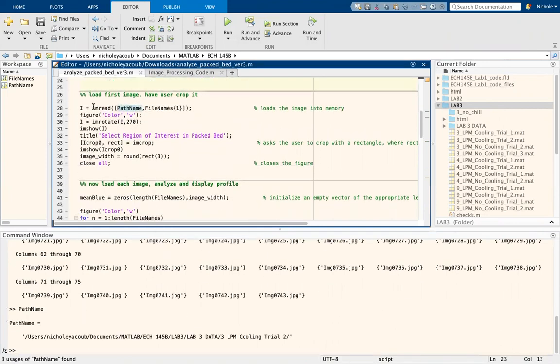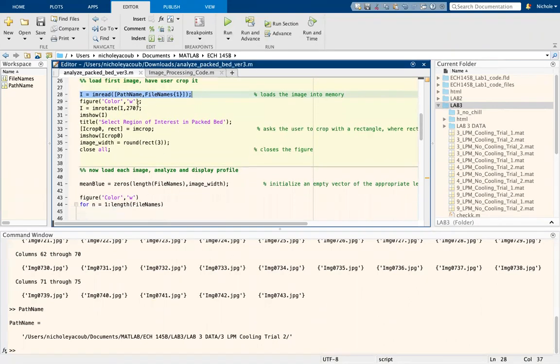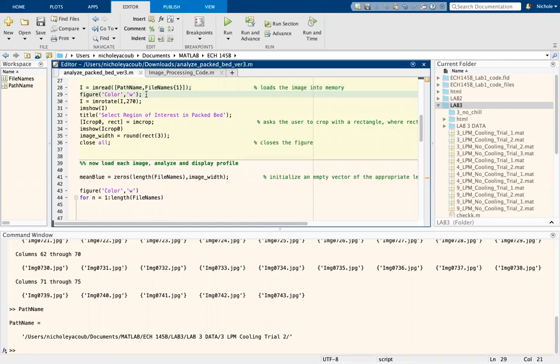All right. Next thing MATLAB is going to do in this line is interpret those files as an image. Do not run this unsuppressed. It's going to take a really long time, and depending on your computer's health, it might crash it. So just know that's what it's doing. It's going to interpret it as a sequence or matrix of numbers. All right. This creates a white background for all your figures.